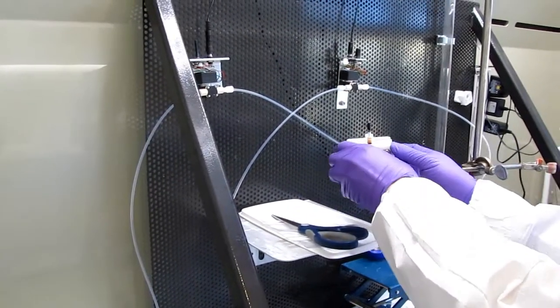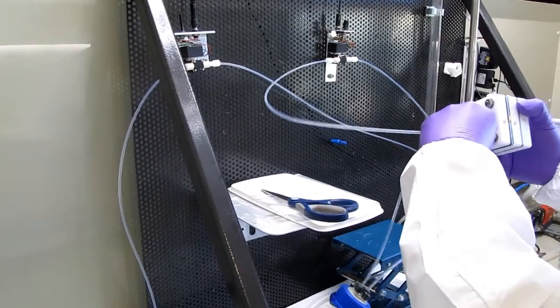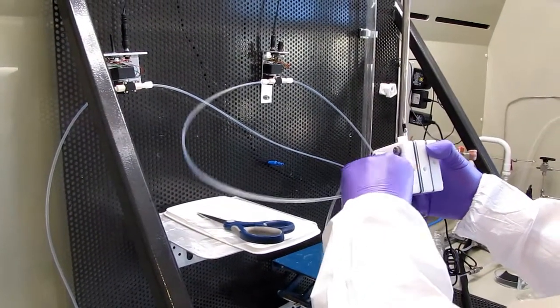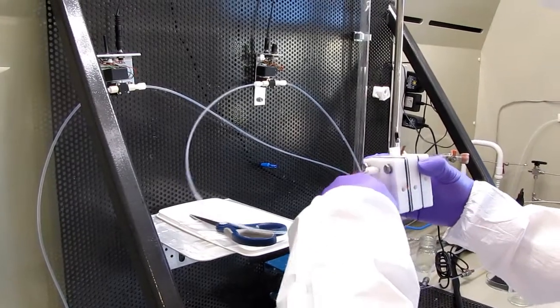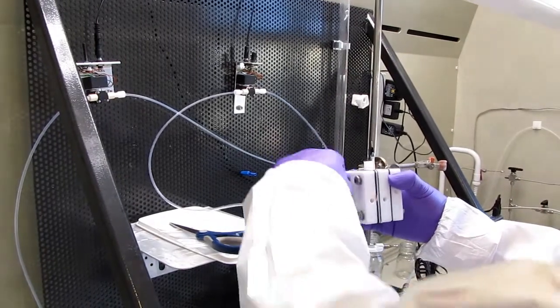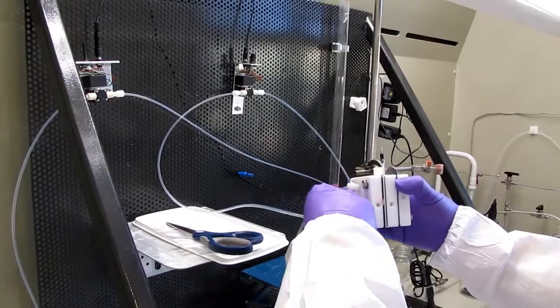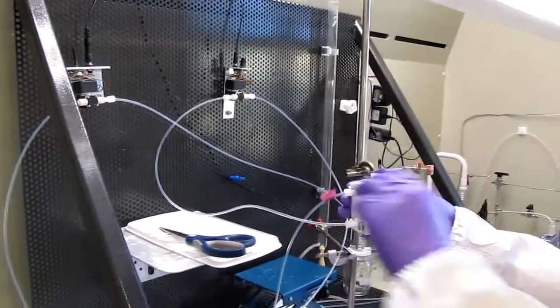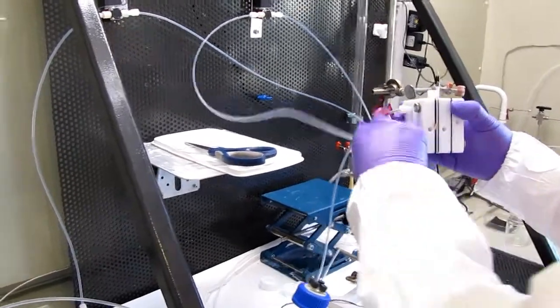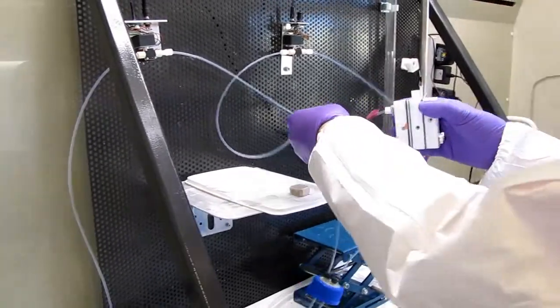It will be stopped, a lot of noise. Also, if we go to high current density, there will be a lot of hydrogen evolution instead of CO2 reduction. Also, if you want to assemble that one, it will take a lot of time, sometimes a whole day. Sometimes you have a lot of problems, so you have to assemble it and then disassemble it if it doesn't work. Yeah, it's annoying.